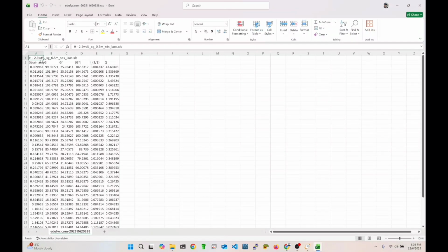And if you have multiple files, when you make an export like this, all your files will be together. So you're probably going to have one file here, some space, another file, another file. When I was working actively here, I normally analyzed multiple files at once. So it's up to you.